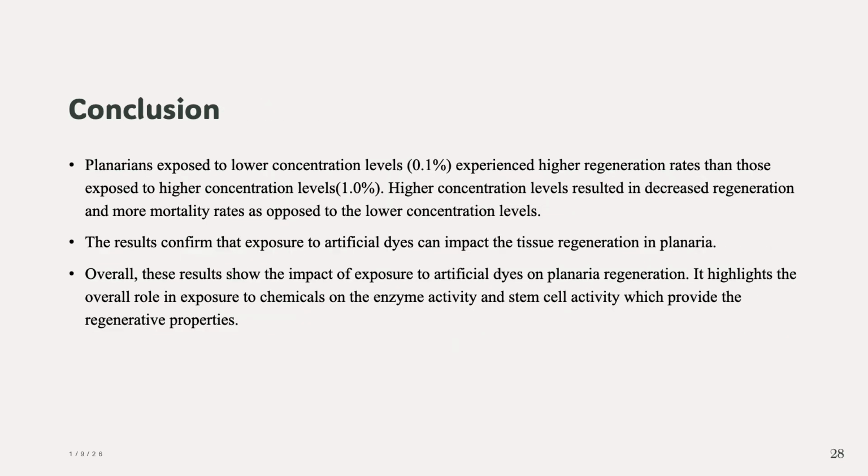Higher concentration levels result in decreased regeneration and more mortality as opposed to lower concentration levels. These results confirm that exposure to artificial dyes can impact tissue regeneration in planaria. It highlights the overall role of exposure to chemicals on the cell activities that provide regenerative abilities.